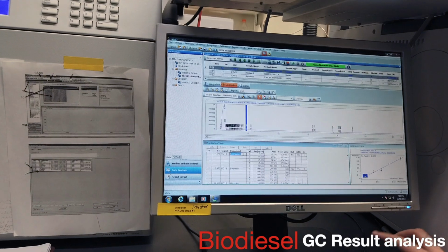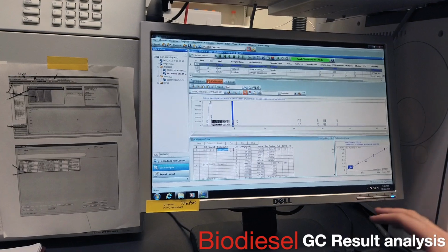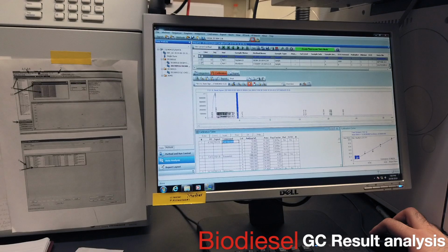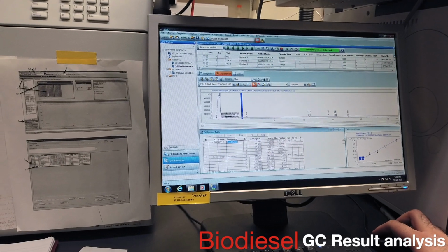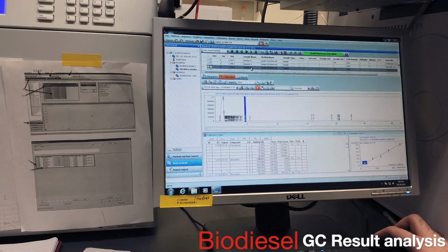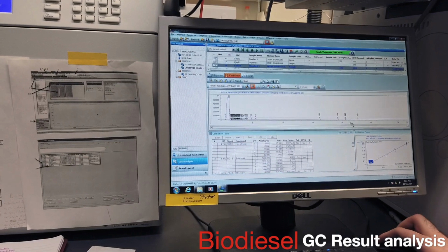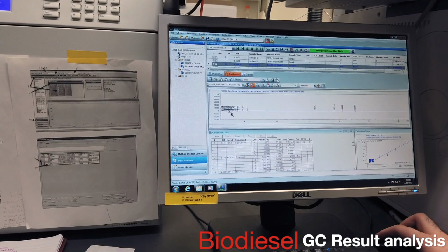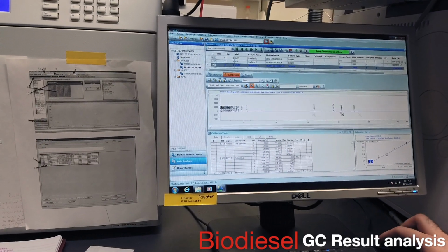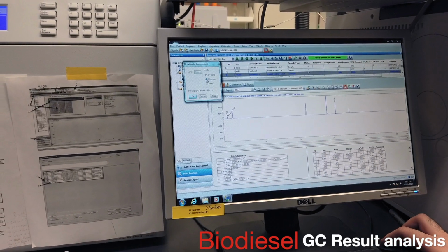So I'm going to mess with it for a second and try to get this a little more linear, because for some reason level 3 is being problematic. So let's figure out why. Level 3, replace.